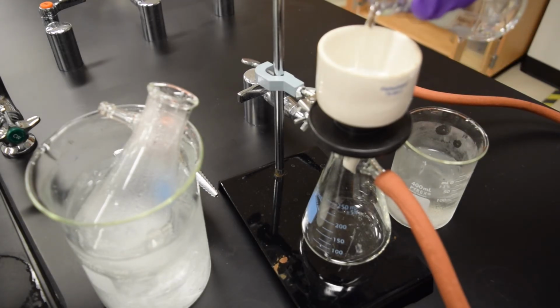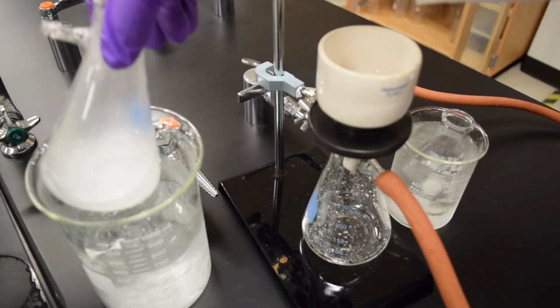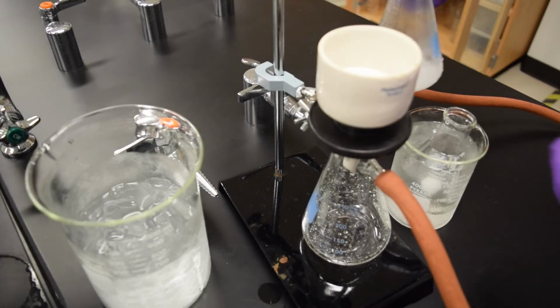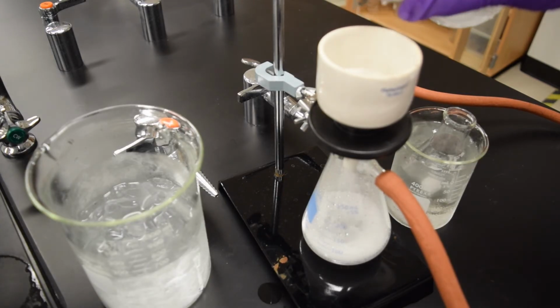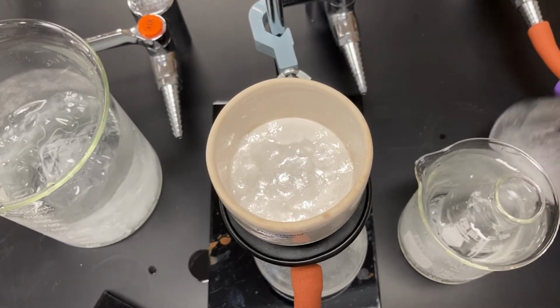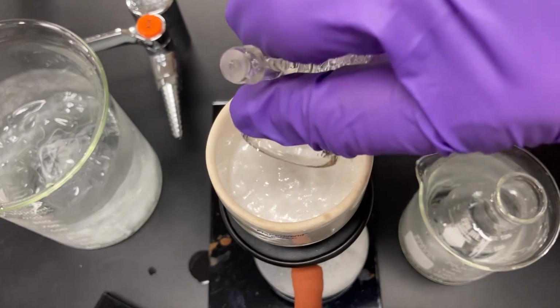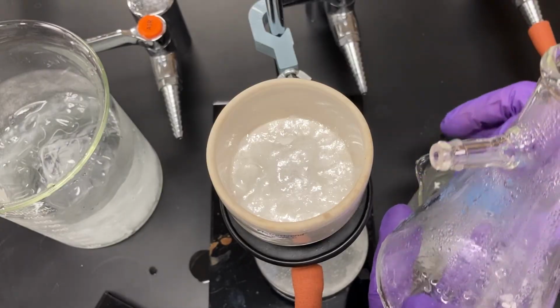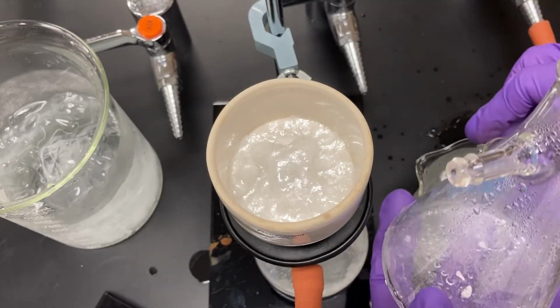I'll run some ice-cold DI water through the Buchner funnel. It's likely you'll have some crystals stuck on the walls of the flask.